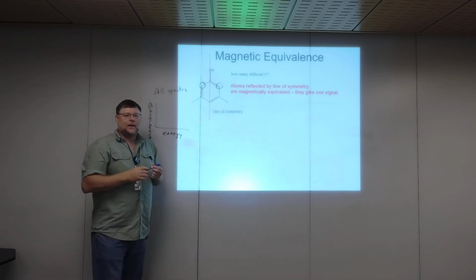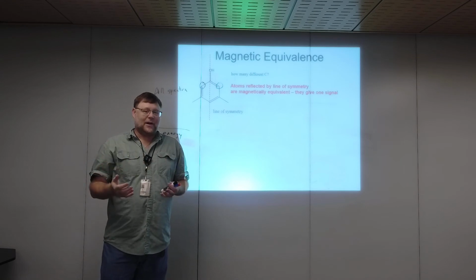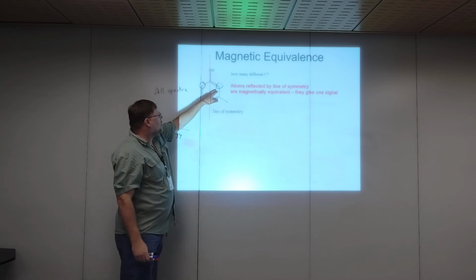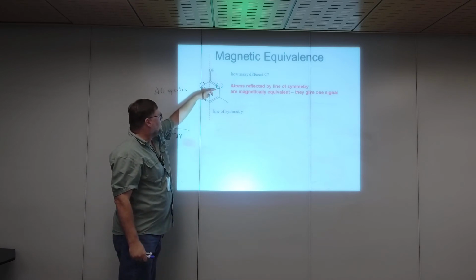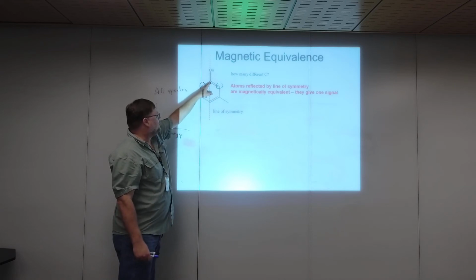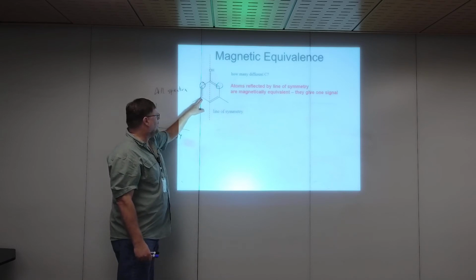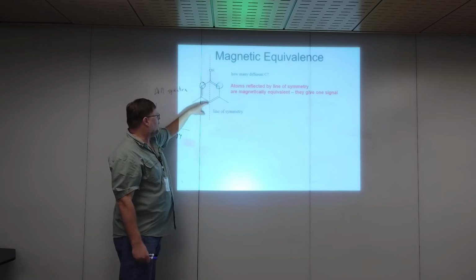If you think about that, the NMR spectrum is giving us information about the magnetic environment around an atom. This carbon is in a benzene ring. It's bonded to an sp2 carbon with a methyl and an sp2 carbon with an OH. It's directly across the ring from an sp2 carbon with a methyl, and it's one over from sp2 carbons with H's.